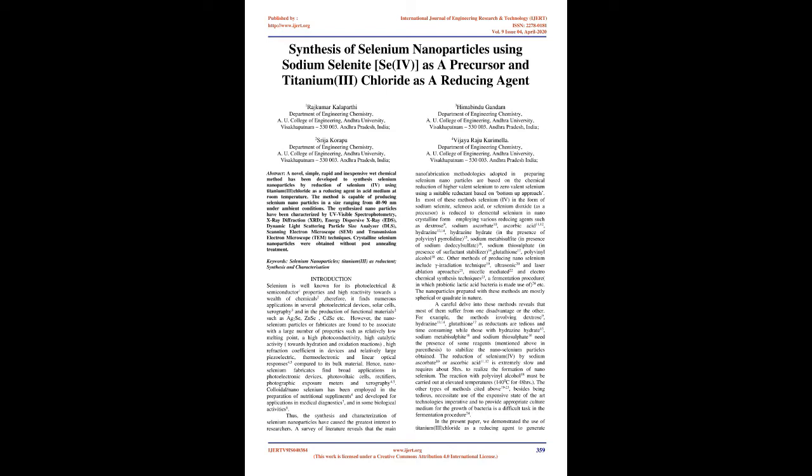Colloidal nanoselenium has been employed in the preparation of nutritional supplements and developed for applications in medical diagnostics, and in some biological activities. Thus, the synthesis and characterization of selenium nanoparticles have caused the greatest interest to researchers. A survey of literature reveals that the main nanofabrication methodologies adopted in preparing selenium nanoparticles are based on the chemical reduction of higher valent selenium to zero valent selenium using a suitable reductant, based on a bottom-up approach.